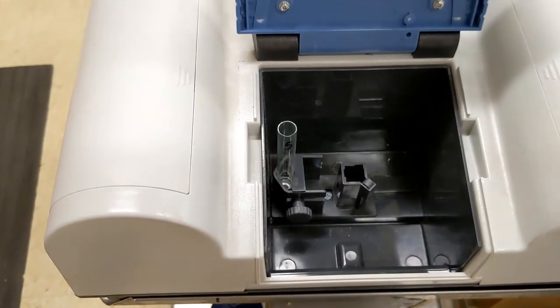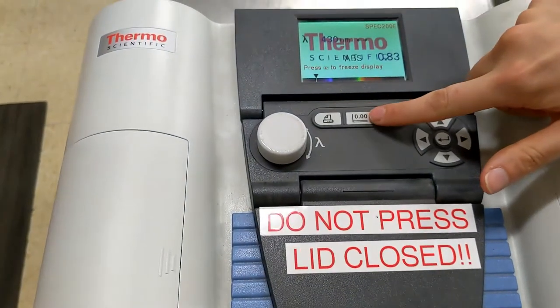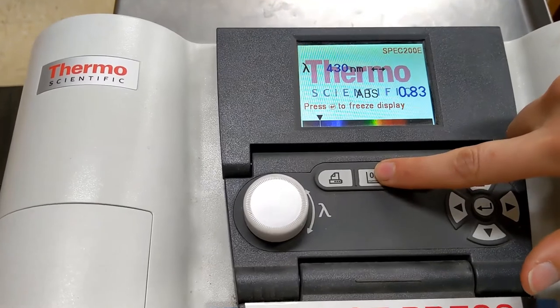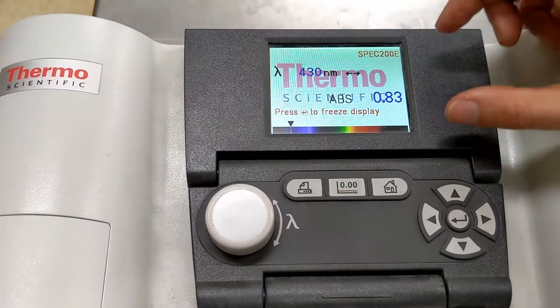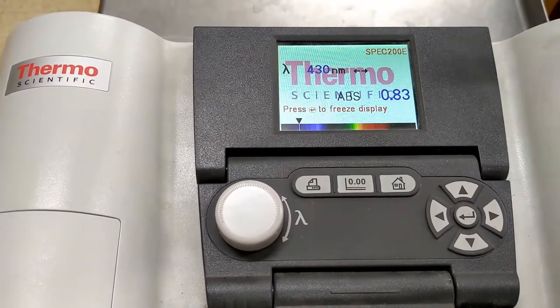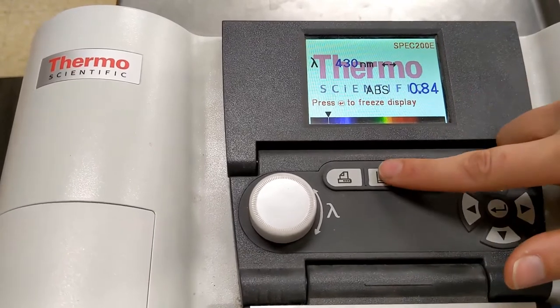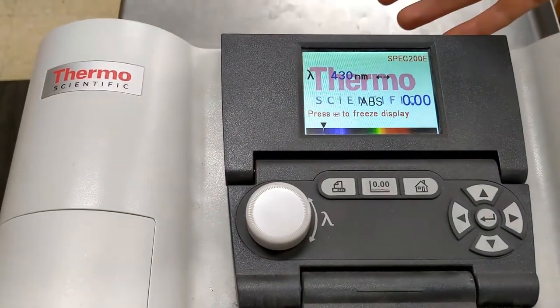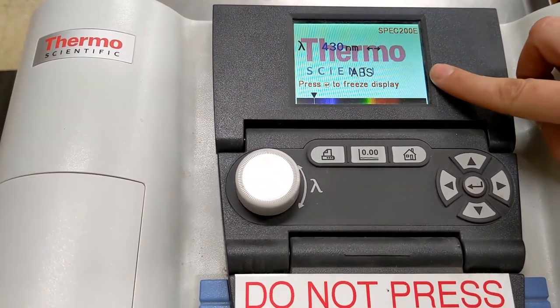I now have my solution in there. I close the lid and hit the blank button. Notice that there is a number given just from that blank — this is the value we are removing from the equation by blanking. Now we have our zero for the blank.